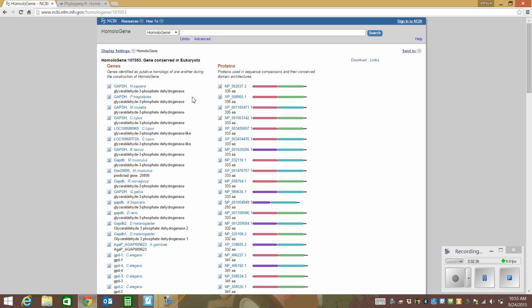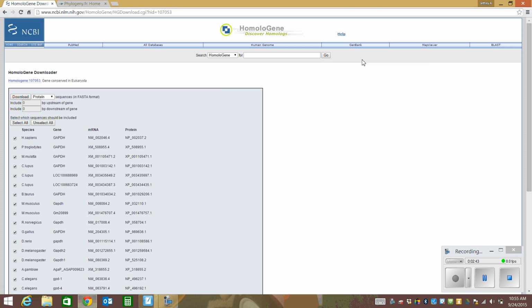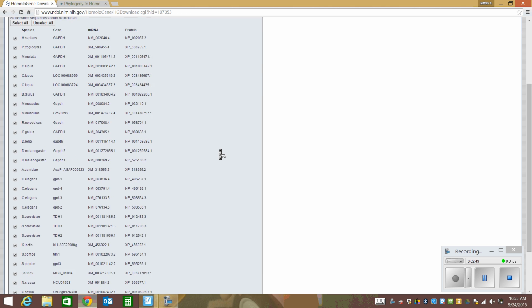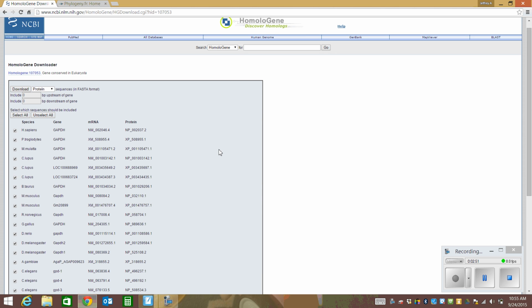The first thing you're going to have to do is actually download this sequence information. You just come over here to this download button, click the download, and you come to this main screen. Now, you're not done yet. This is just showing you that these are the ones that you truly want to download. And the answer is yes, we definitely want to do that. So we're going to come over here, we're going to hit the download. And when we do that, you notice that I'm downloading.